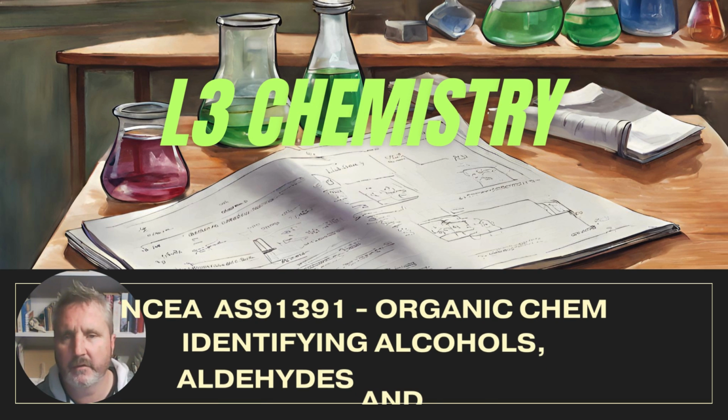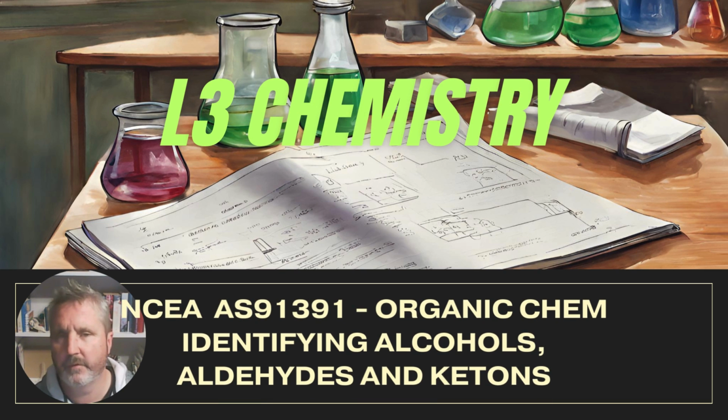How can we identify unknown samples of aldehydes, ketones, and primary, secondary, tertiary alcohols? Well, this video is about that. I will go over the tests that we can carry out in the lab to identify these different organic compounds.